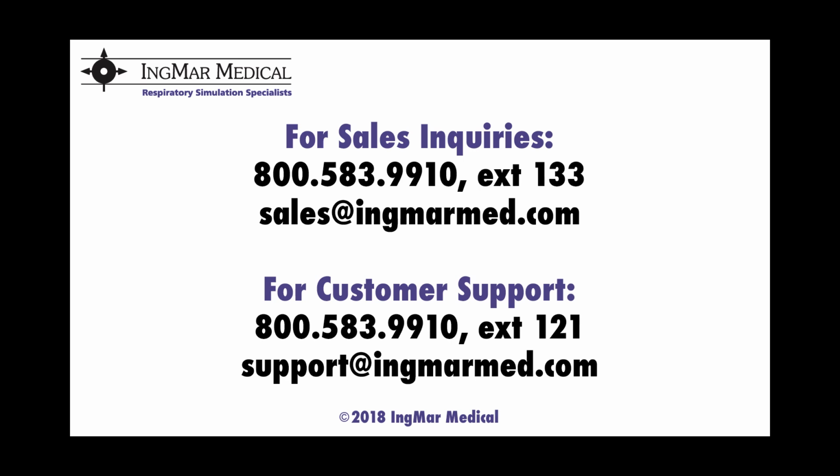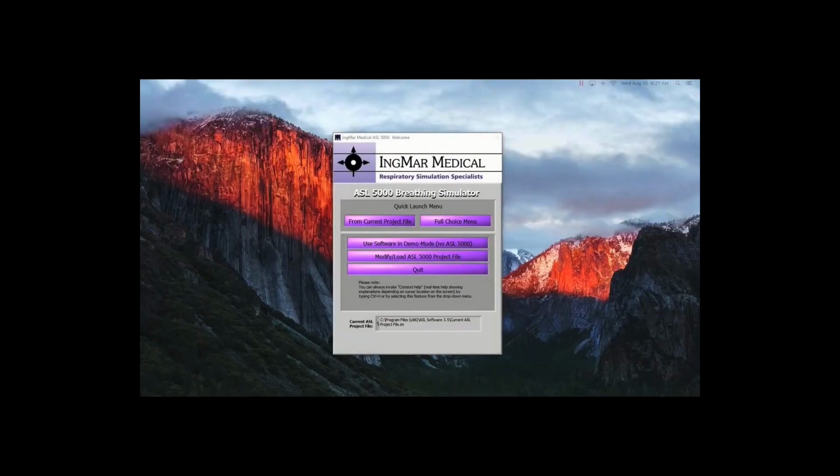Okay, let's move on here. We do have a question from Susan. Susan asks, what if I can't change my RS-232 COM port due to administrative rights of the computer? This is where I like to show our parallels, so we could show the actual software. Let's make sure we're showing the screen. Okay, so everyone should be seeing our welcome window now to the software.